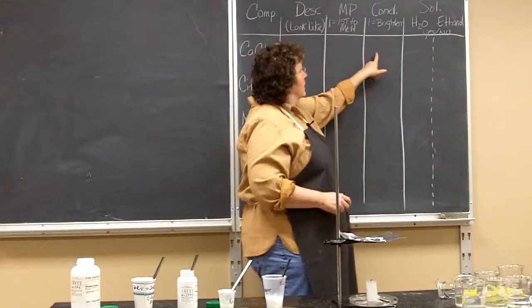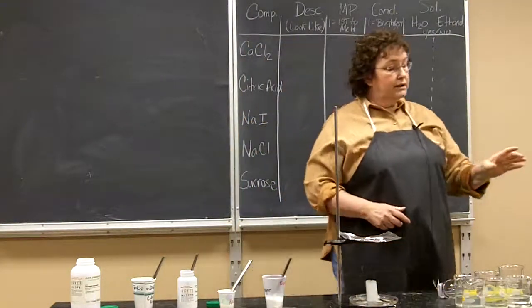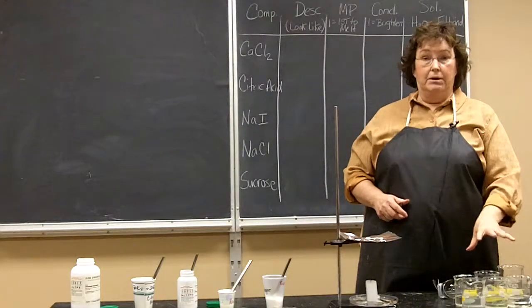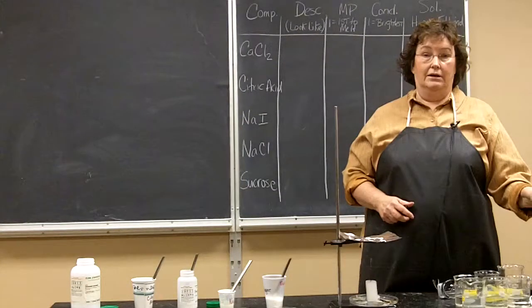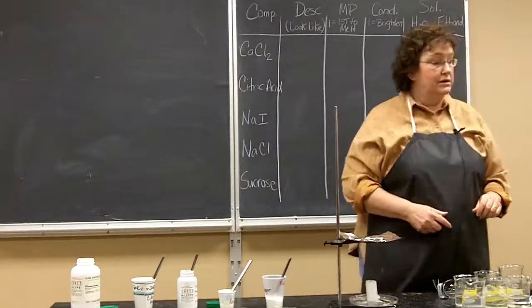The next one is their conductivity. C-O-N-D is conductivity. Right, this is a conductivity meter. If I put this into a solution that is able to conduct electricity, guess what happens to that light bulb? You'll have to wait and see. But that's our conductivity test.